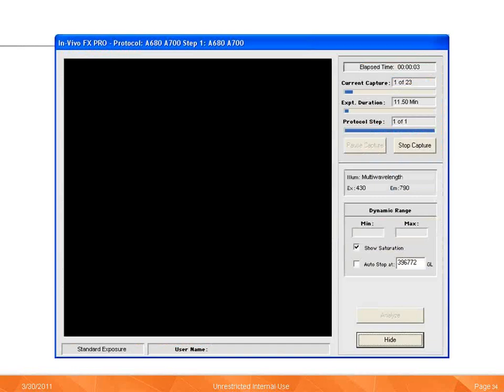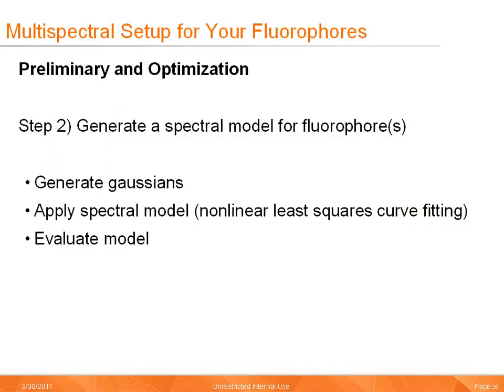The system provides multiple status indicators as a protocol progresses. These indicators include capture step, total duration, and the current filter settings. Now that the acquisition is complete, the data is available and we'll next generate spectral models.